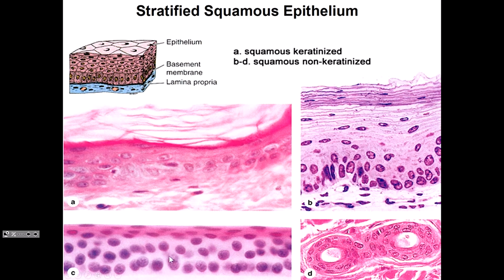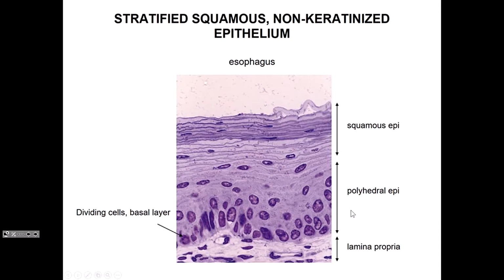Pardon me, this is the cornea. You can see these are more or less cuboidal, and then those layers in contact with the air are squamous, so stratified squamous. This looks like integument, skin. Again, stratified squamous. This is not a good example, so don't worry about that. Okay, stratified squamous again. This is the integument, the skin, the epidermis. This would be an internal cavity because there's no keratinized cells, but you can see multiple layers of cells, and then these are very squamous. So stratified squamous epithelium. Yes?